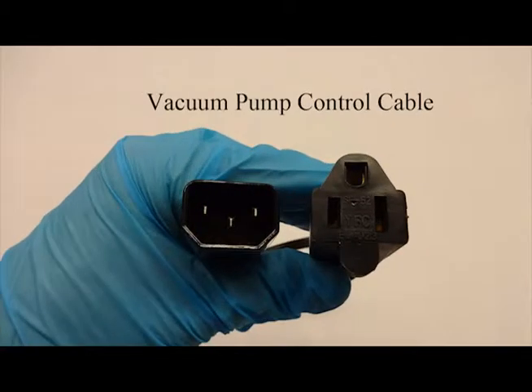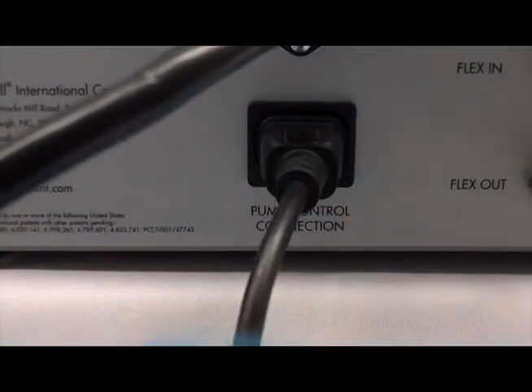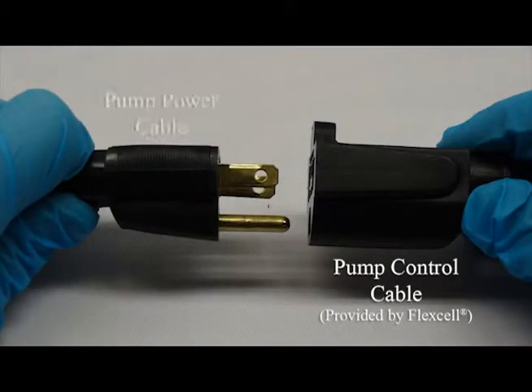To connect the supplied pump control cable, connect the male end to the pump control connection outlet on the back of the FlexLink controller. The opposite end of the cable connects to the vacuum pump power cable.